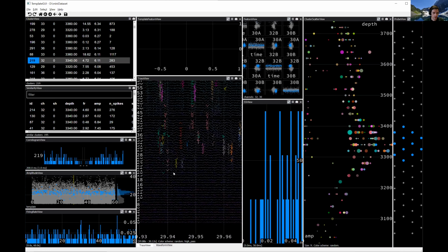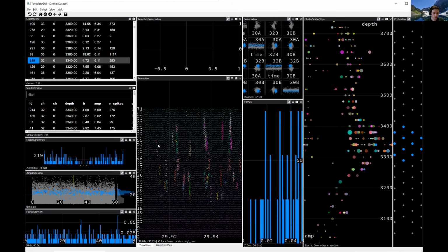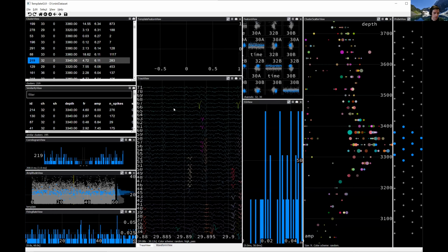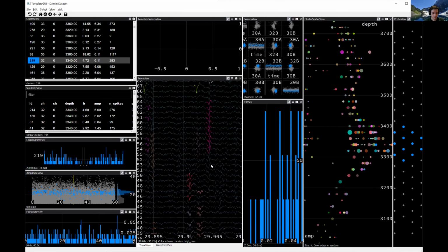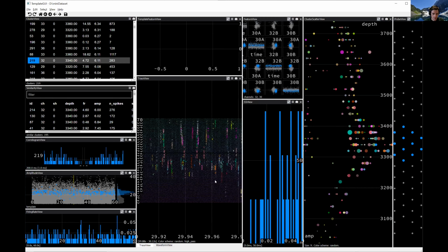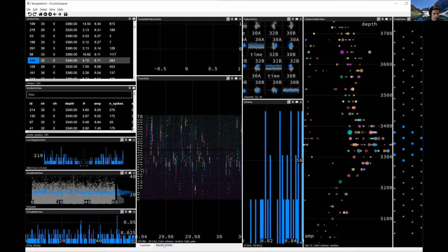And this is also useful, like the Kilosort GUI, for highlighting where it does and does not find spikes. So for instance, this run of Kilosort maybe didn't work super well. It didn't find any spikes there where it looks like there's a spike. And likewise, maybe there and there. But most of the places that there are spikes, it has found them. Okay, so that's trace view.